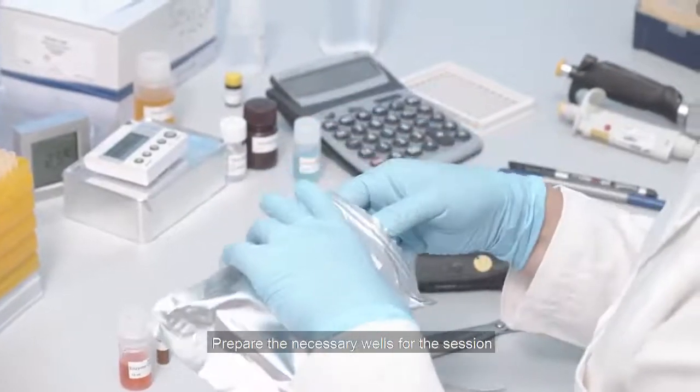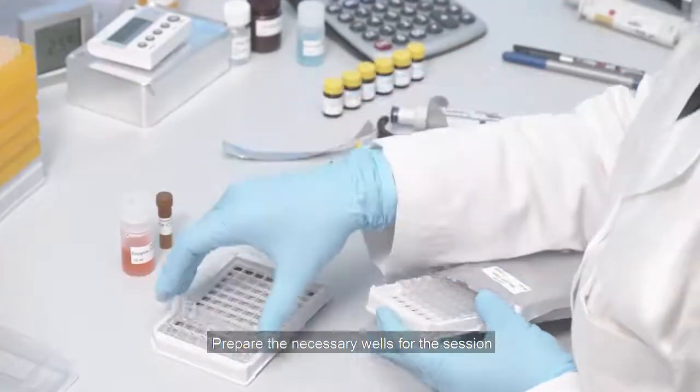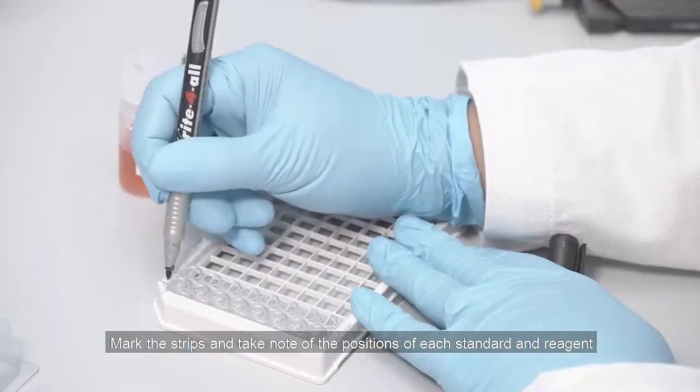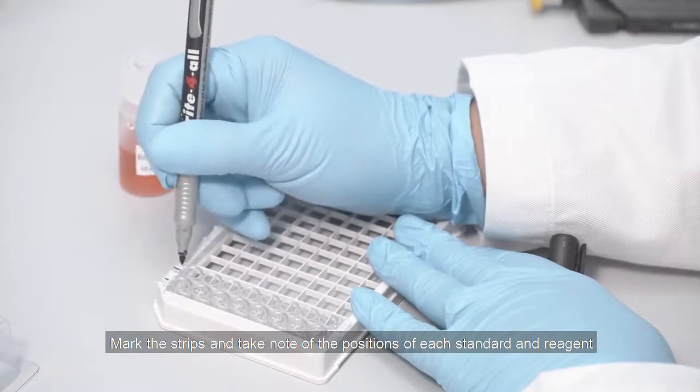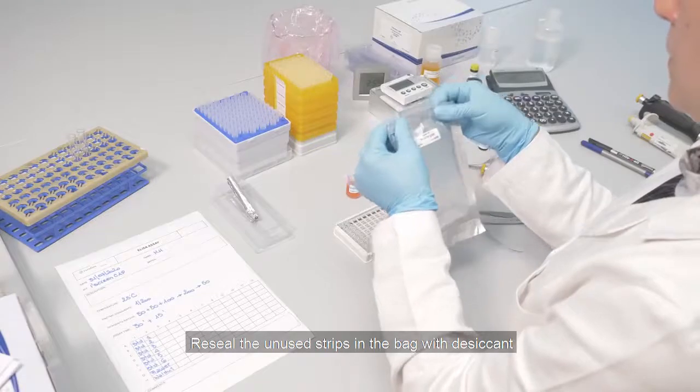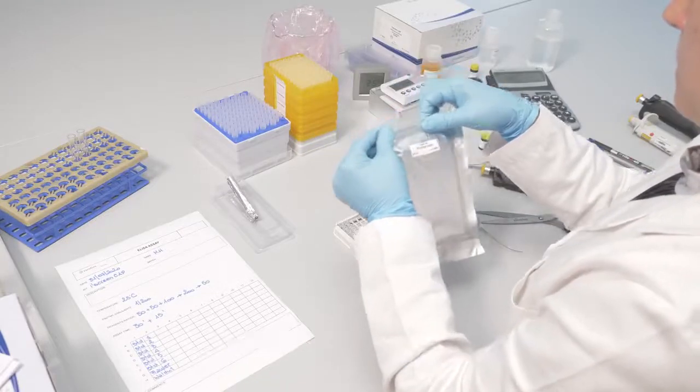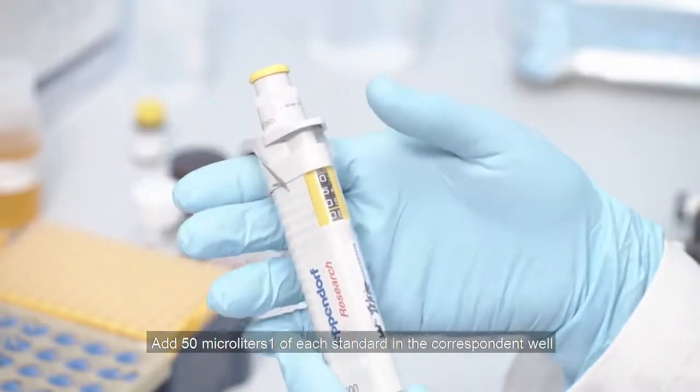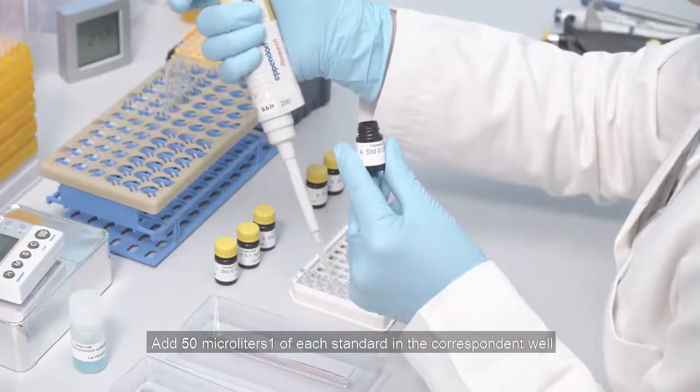Prepare the necessary wells for the session. Mark the strips and take note of the positions of each standard and reagent. Reseal the unused strips in the bag with desiccant. Add 50 microliters of each standard in the corresponding wells.